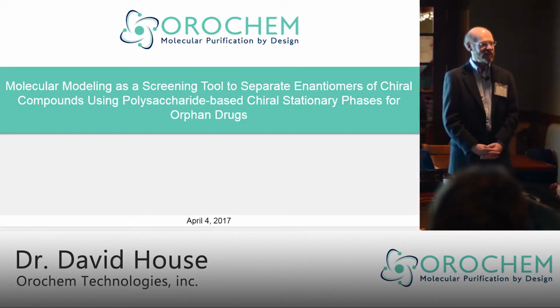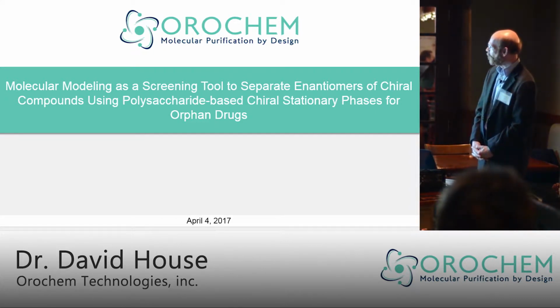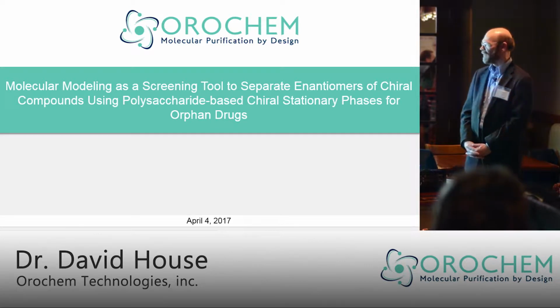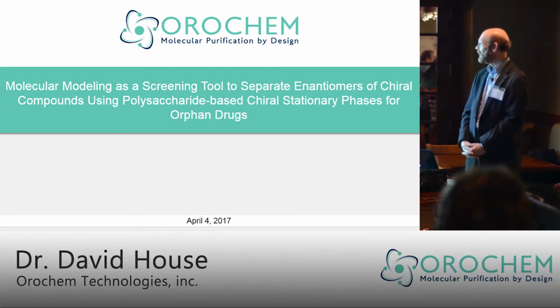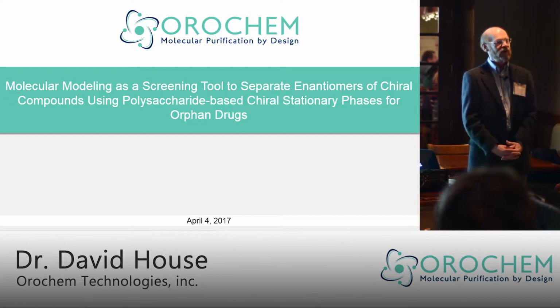So, with that said, tonight's presentation is molecular modeling as a screening tool to separate enantiomers of chiral compounds using polysaccharide-based chiral stationary phases for orphan drugs. Fortunately, the title also serves as the abstract.